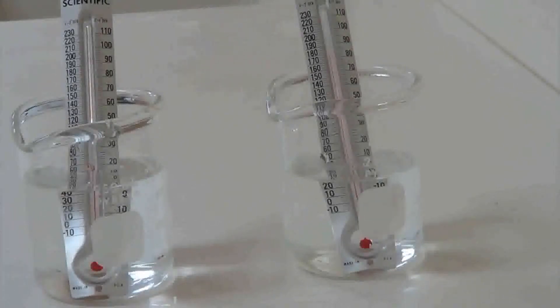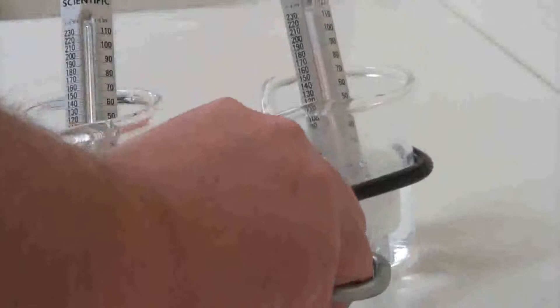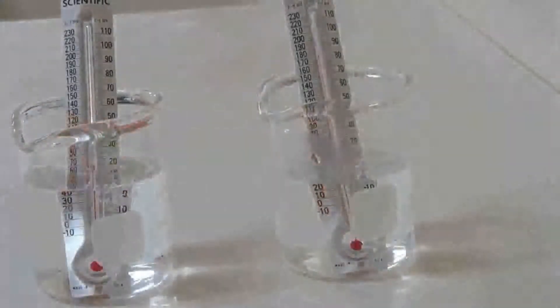If you were to go to handle these, knowing that one of them had been heated, well, with a thermometer it's easy to tell. But if there's any concern that it might be warm, don't grab it with your hands. Use another object to move it.